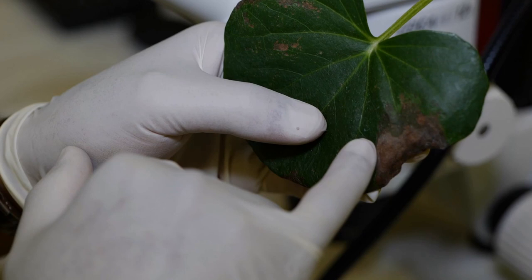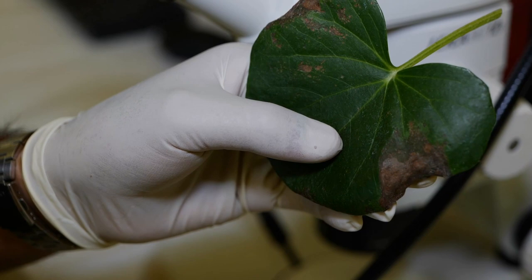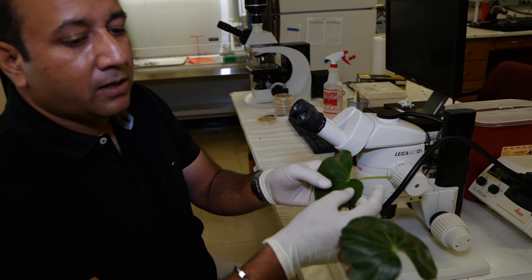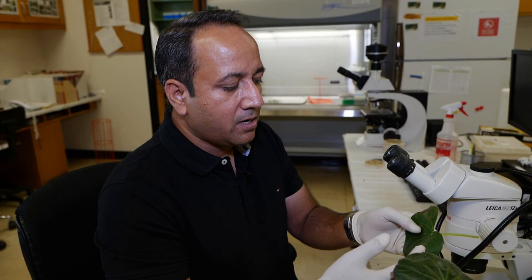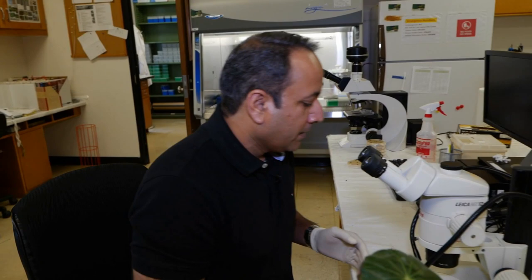After this, what we like to do is we will cut this tissue out from the transition zone here where you have the healthy and the dead part. Now we plated on different kinds of media in order for it to grow out of that medium, and then we can ID it depending upon what kind of spores it's producing, what kind of bacterial colonies it's producing. We can have an idea on what we're dealing with - if it's a plant pathogen, fungal pathogen or bacterial pathogen. Viruses you can't culture out, so we have different tests for viruses.